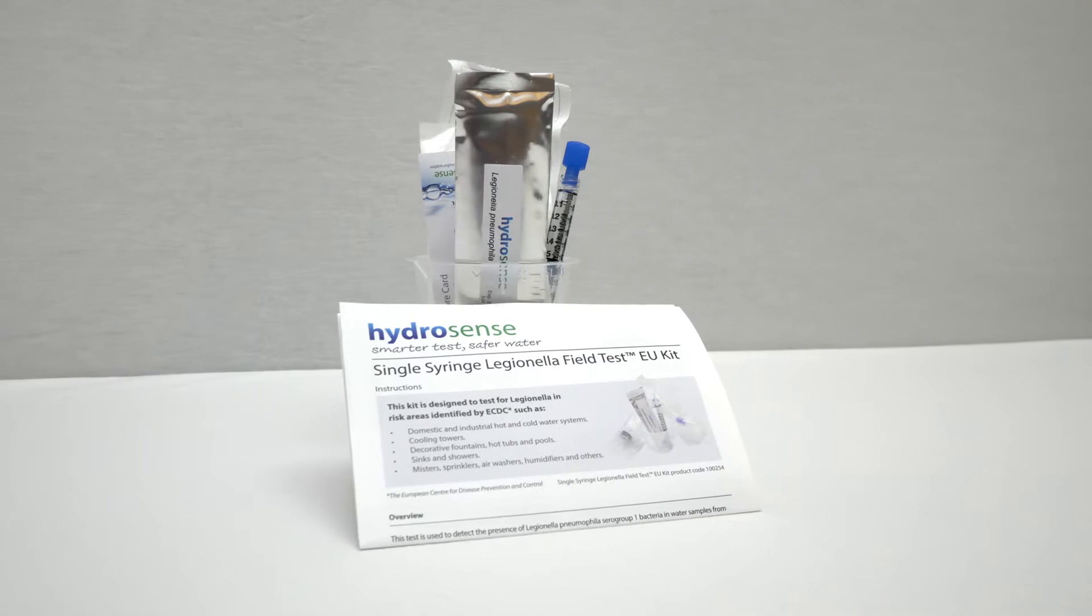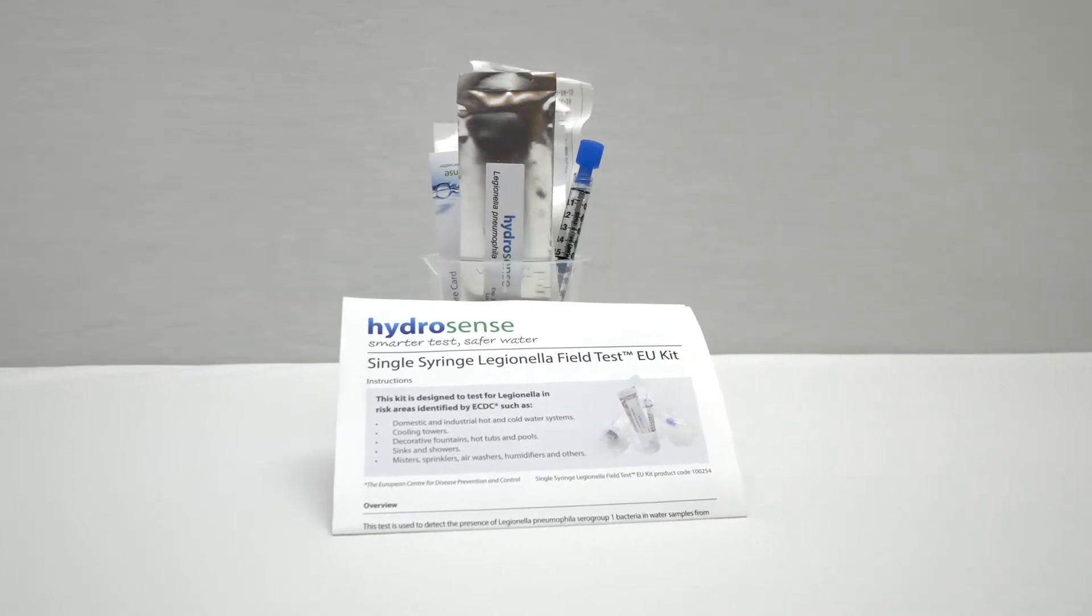Hello, I'm Richard Campbell and I'm the technical director for HydroSense. Today I will be giving you an instructional video on how to use the single syringe Legionella field test EU kit.